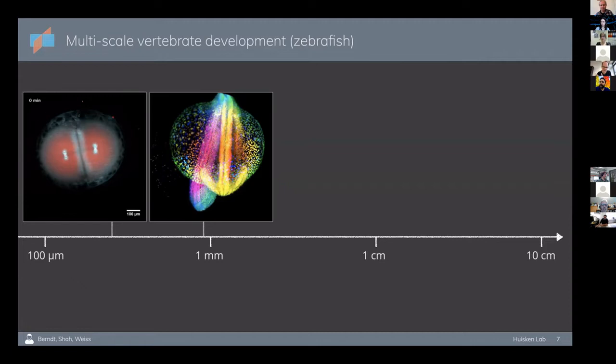And so part of the challenge for the future, obviously, is then to develop some more high throughput techniques where not just the imaging is high throughput, but also the data analysis, which I think is the key challenge for the future, being able to extract meaningful information out of this.